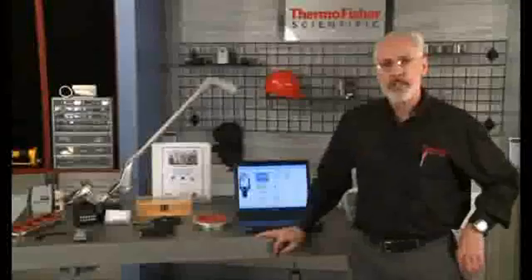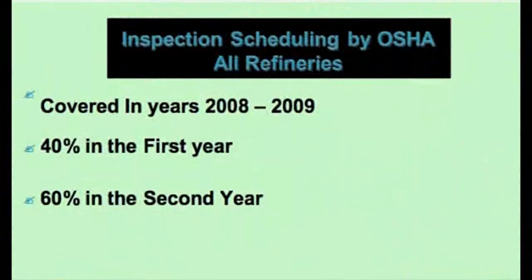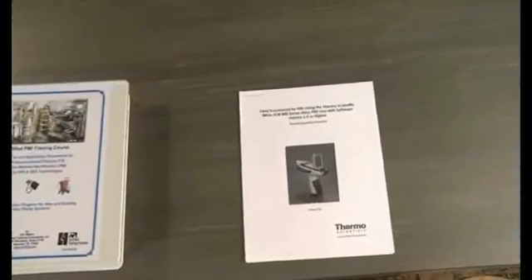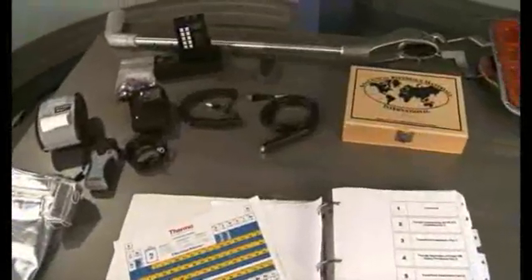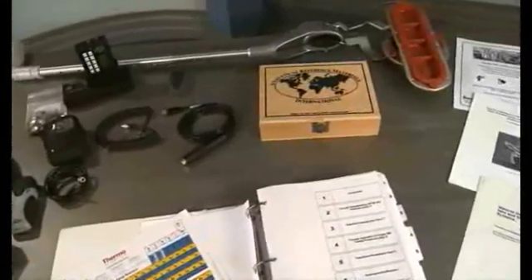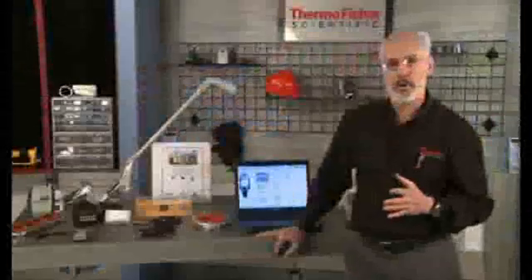api578.com. Given the record of serious accidents and deaths in the petrochemical industry, OSHA is also conducting on-site inspections in the United States to assure that we're following best practices in PMI testing. To complement this effort, in conjunction with Analytical Training Consultants, or ATC, we offer a 2-day API-approved certification course. Additionally, we have developed a comprehensive turnkey PMI testing program. These new developments in technology and training are making it easier to perform PMI in more locations with greater accuracy, with better trained operators than ever before.